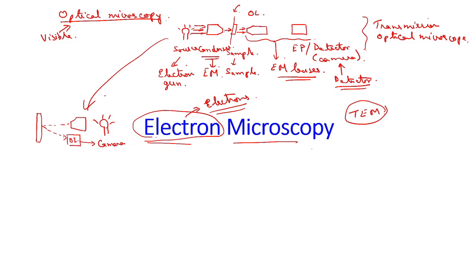Okay, so this was regarded as reflected light microscopy.